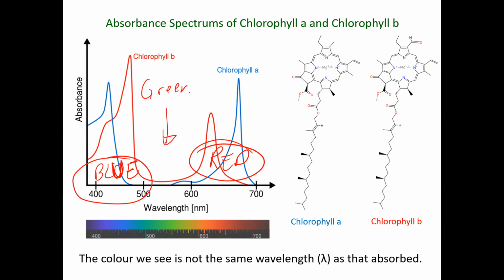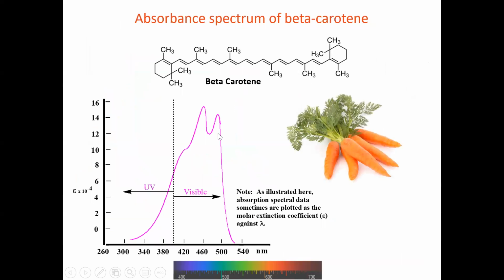Green. So this is kind of how things are colored, right? Whatever light they don't absorb is the light that is reflected or transmitted, and these things look green. So we can take advantage of this property, and there's literally hundreds of applications around spectroscopy, and it's really kind of mind-blowing how many ways people use spectroscopy. But what I want to do is talk about how we're going to use it in the lab, and probably the most common way that this type of spectroscopy is used.